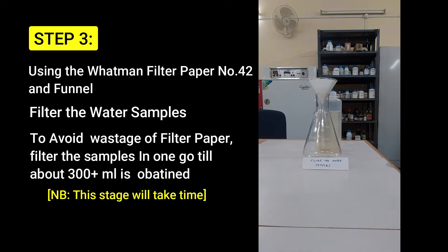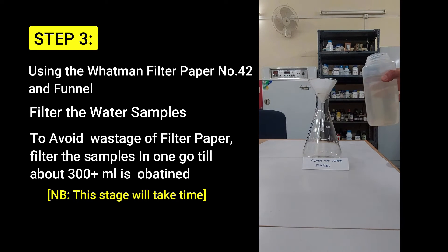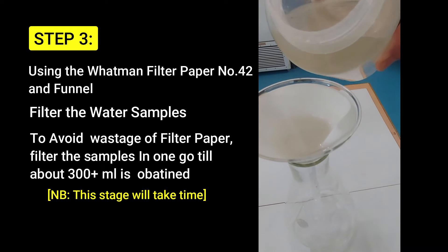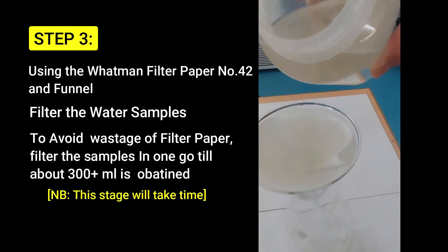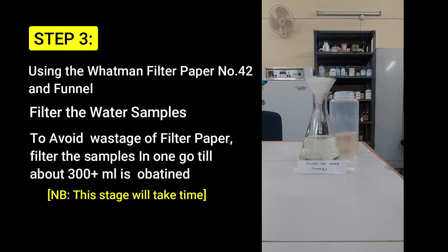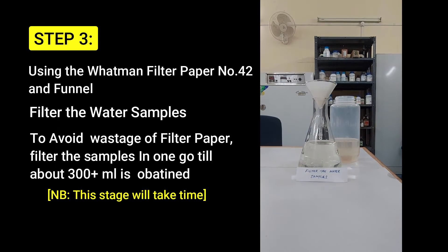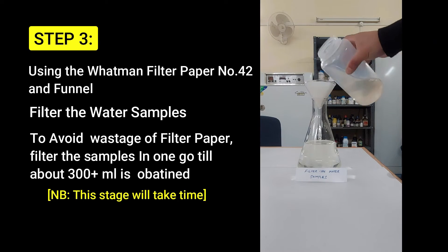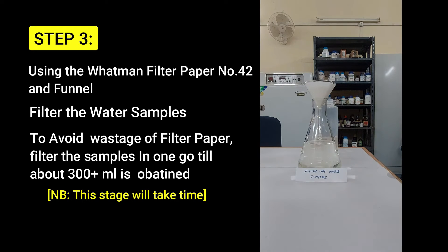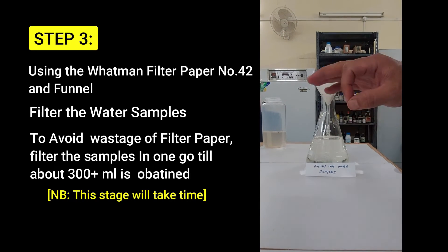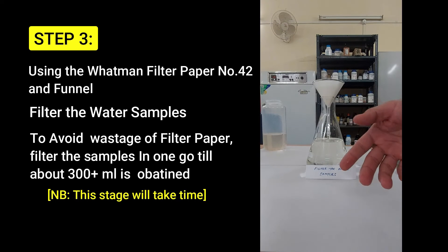The next step: using Whatman filter paper number 42 and a funnel, filter the water samples for which you want to determine the total dissolved solids content. To avoid wastage of filter paper, filter the samples in one go until you obtain about 300 ml of filtered sample. This stage will take time, so be patient.